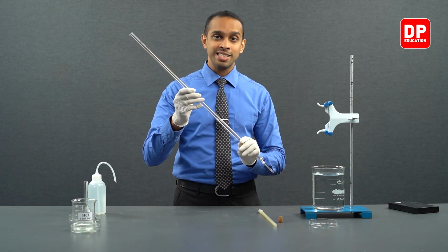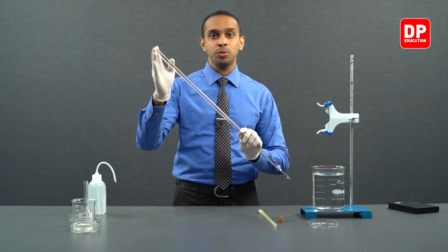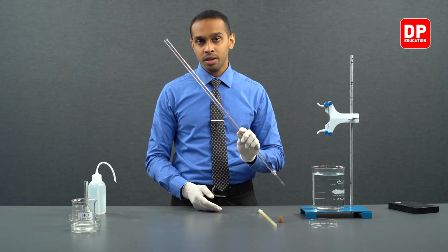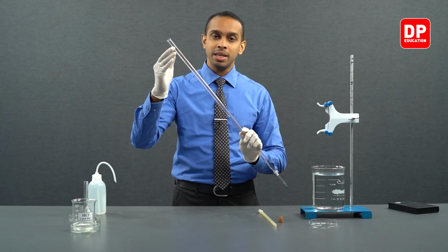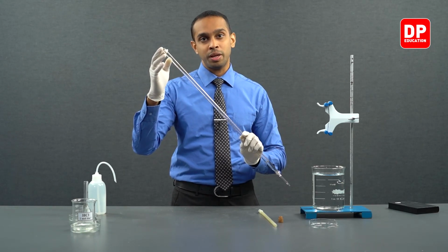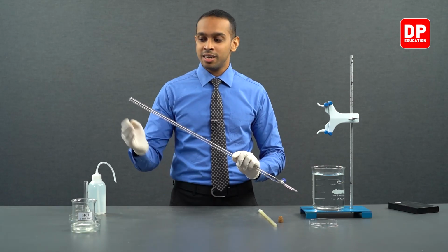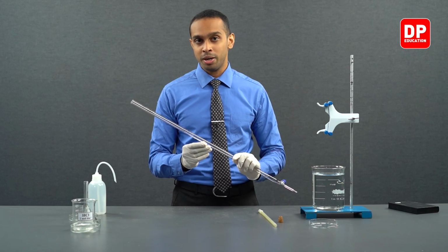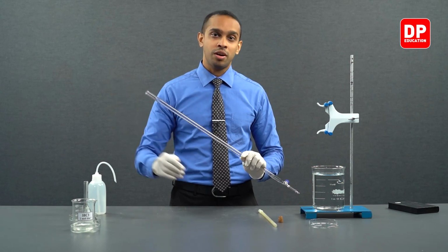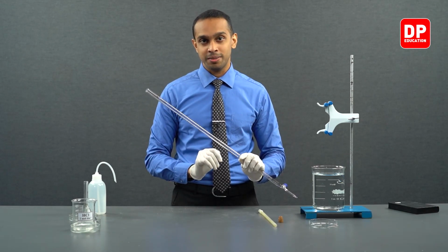The reason for this is we need to have some time to fix the magnesium strip into our burette and then turn the entire burette upside down. If HCl is completely mixed with the water, as soon as we introduce the magnesium strip into this mixture, the reaction will start to happen. If this reaction starts as soon as we insert the magnesium strip into the burette, then some amount of the hydrogen that is produced will go out of the burette before we secure this setup in this retort stand.